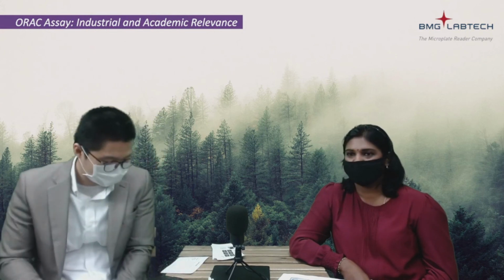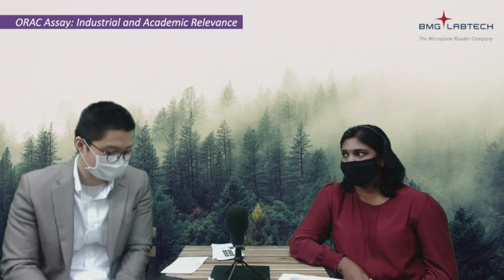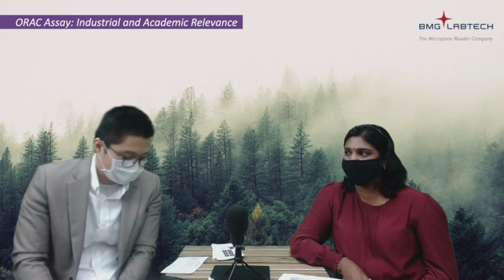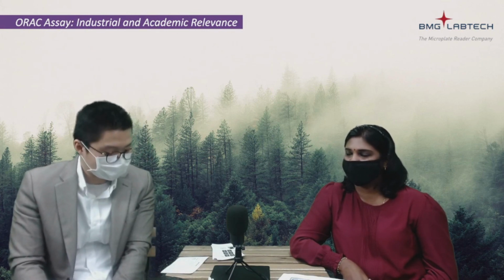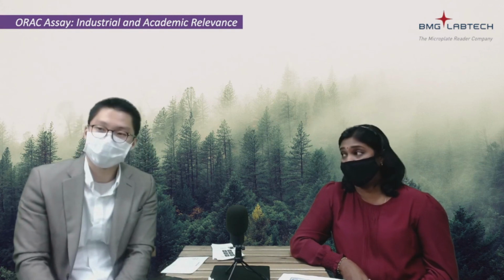Dr. Bhaskaran again, there's another question. He says that one antioxidant assay by itself cannot be conclusive in terms of concluding the antioxidant capacity. So based on your experience, what other assays can we use to complement the ORAC assay? Okay, to complement the ORAC assay, you can use the CAA assay, which is the cellular antioxidant assay. Some of the assays use erythrocytes, so you can also use that type of assay to complement the ORAC assay.